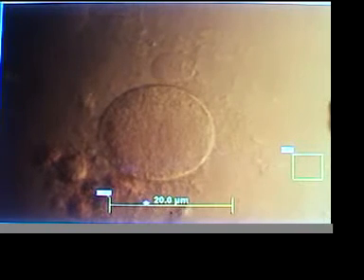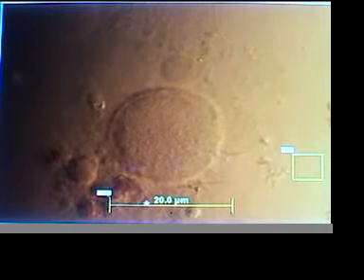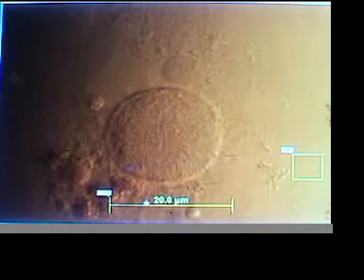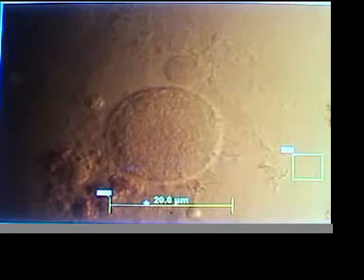And I'm adjusting the focus controls. It's like simulating a DIC filter. This is just a regular red filter. All kinds of activity happening on what looks to be the cell membrane there. I think if you look carefully, that does show up in the camera.